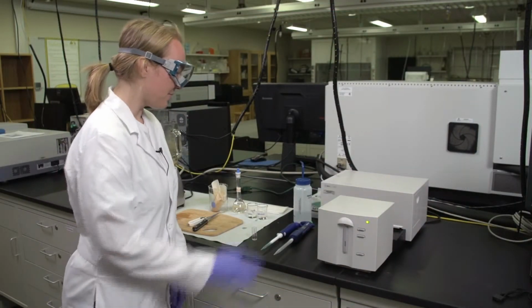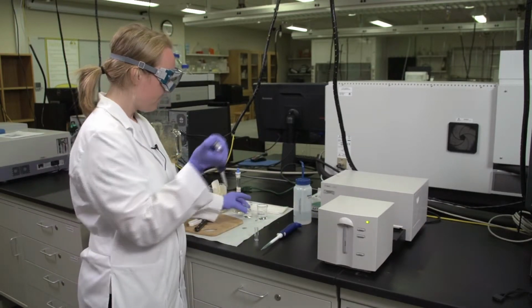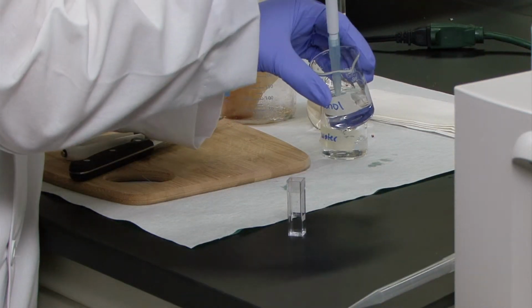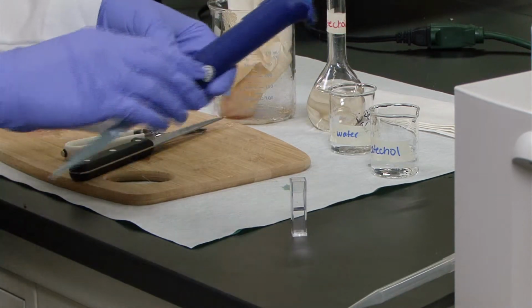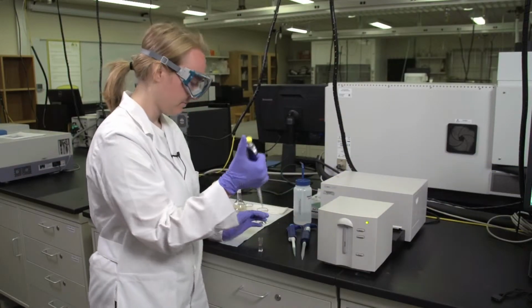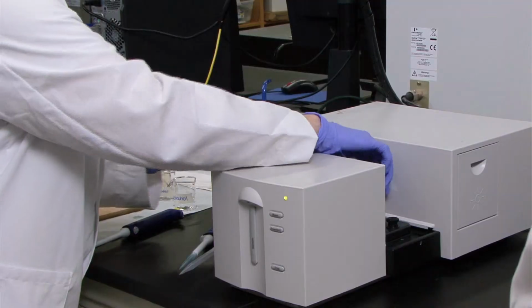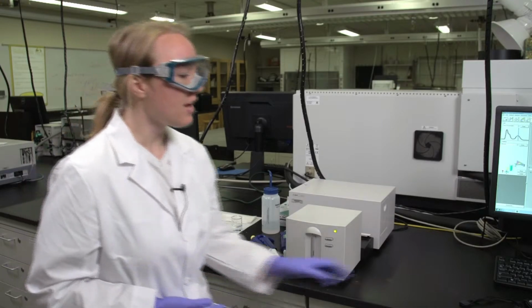To prepare the cuvette for the sample collection, you'll want to put the appropriate amounts of water and catechol in the cuvette. Have your partner get the apple enzyme solution from the hood, and then you can put that into the cuvette as well. Then put the cuvette into the sample chamber. But instead of just taking a sample, you'll need to wait 5 minutes for it to equilibrate to room temperature. You can use a stopwatch to do that.